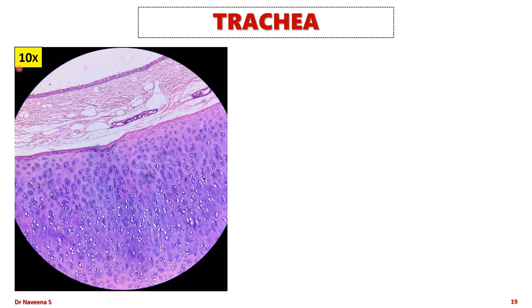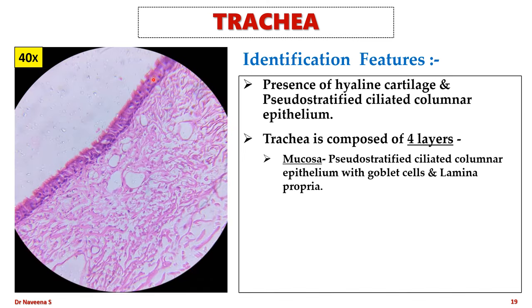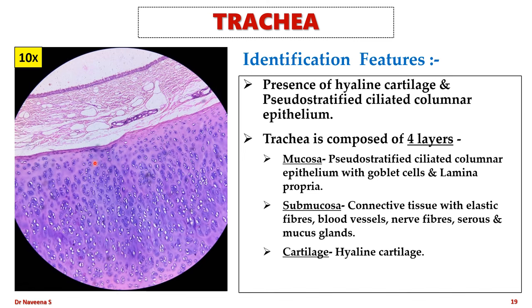Now let's see the slides of the respiratory system. Trachea: here is the slide seen under low magnification. It is identified by the presence of hyaline cartilage covered by pseudostratified ciliated columnar epithelium. The wall of the trachea is composed of four layers from inside to outside: mucosa, submucosa, cartilaginous layer, and adventitia. The mucosa is lined by pseudostratified ciliated columnar epithelium with goblet cells, supported by lamina propria of loose connective tissue with blood vessels. The submucosa is loose connective tissue with elastic fibers, blood vessels, nerve fibers, and serous and mucous glands. The cartilaginous layer is hyaline cartilage surrounded by perichondrium. The adventitia is loose connective tissue with blood vessels.